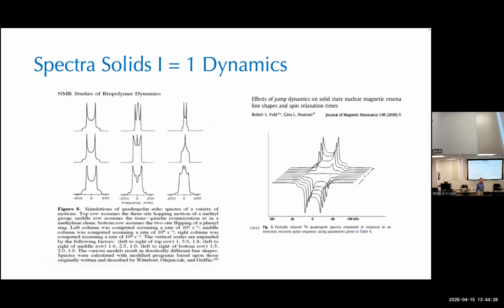Oh, well, that would be tuned differently, so there's no way to do that without having a little bit of inherent loss. You probably end up losing performance in terms of the inherent pulse length, but you're going to go to a different combination of the inductor and the capacitor, and possibly a little bit of extra resistance even. And then you're looking for something which has a higher Q and still has very symmetric characteristics.